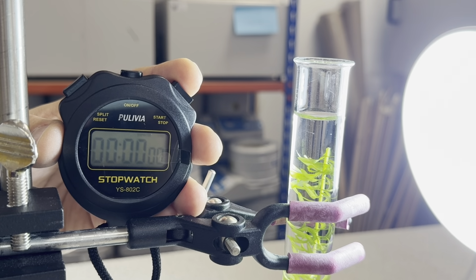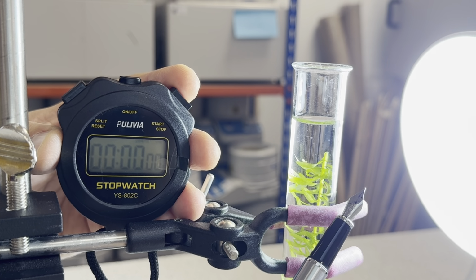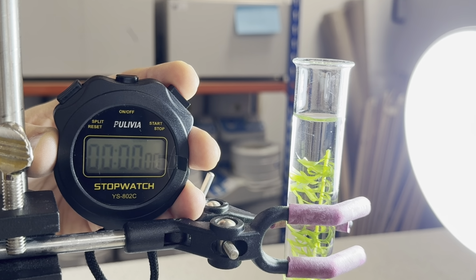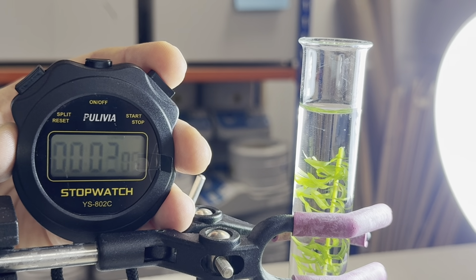Okay, so now we have a 10 centimeters distance working, and I can see the bubbles coming from my stem, okay? So as soon as it's bubbling, I start my timer. I'm gonna count for 30 seconds how many bubbles I have.